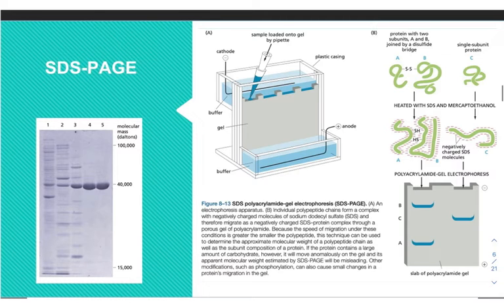And that's going to matter if they give you weights, which will often be seen in kilodaltons. A dalton is a measure of molecular weight, and then kilo is just our prefix, right? So you're going to see that application, like if you have a tetramer, which is a 4-subunit protein, and the tetramer is, I don't know, 10,000 kilodaltons. I'm bad with these numbers, so that may be ridiculous. Apologies in advance. So then you would divide 10,000 by 4, and you would get like 2,500 for each subunit. And that's the number that you would expect to see in your SDS-PAGE.